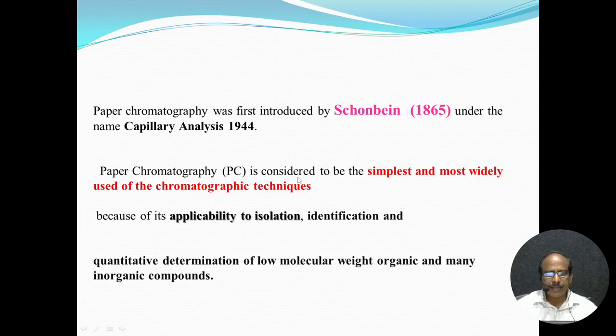Paper chromatography is considered the simplest and most widely used of the chromatographic techniques. Its applicability is also very important, because it allows easy isolation, identification, and quantitative determination of low molecular weight organic and many inorganic compounds.